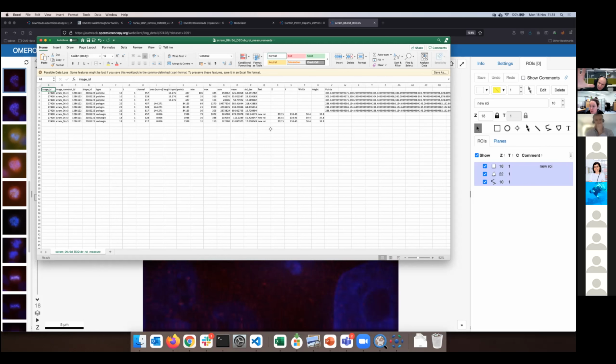You leave the big beast nicely on the server. It's taken care of for you there by the administrator, and you work only locally with what you need. You don't need it all locally, but still you have it at your fingertips. It's all there on the server. You can move your laptop, you can switch your laptop, you can change the machine. You still have access, because as long as you have any internet access, you will be able to do that.